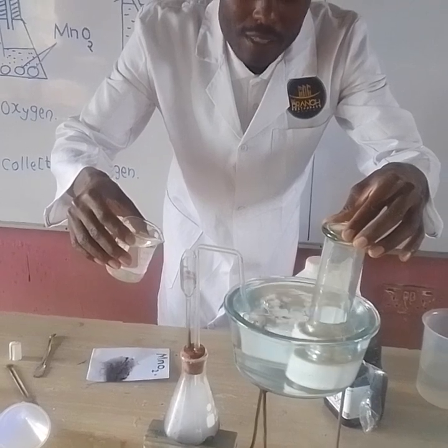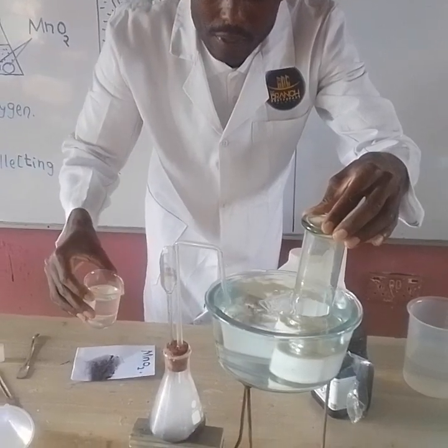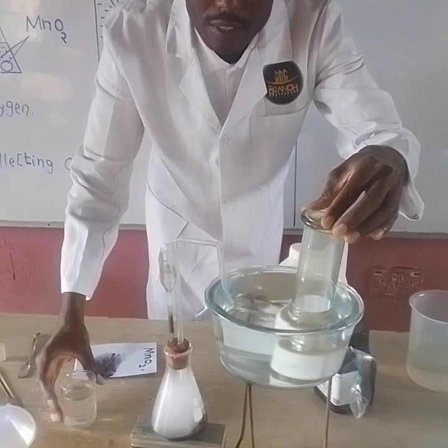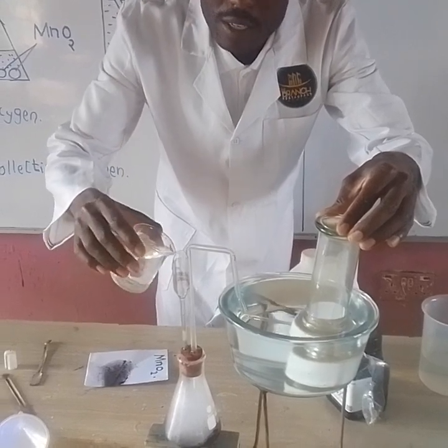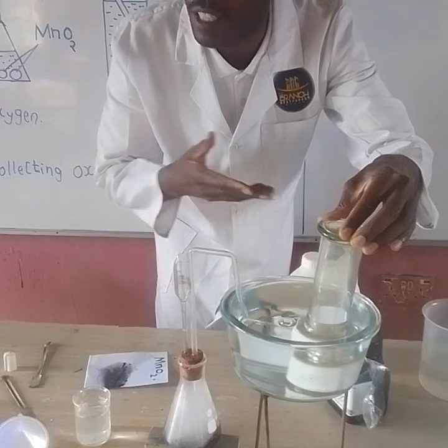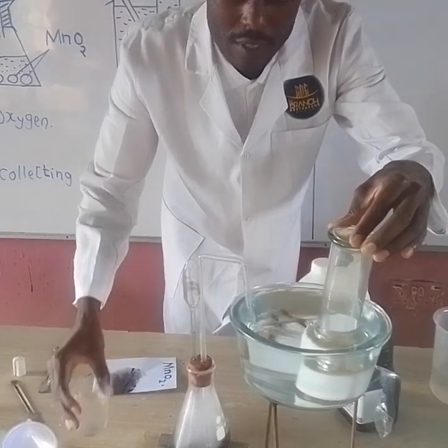Are you seeing now the gas bubbles? Those are the gas bubbles. Are you seeing the gas bubbles on the petri dish? Those gas bubbles are due to production of oxygen gas. My student Emmanuel, are you seeing? Yes, I am able to see the gas bubbles.